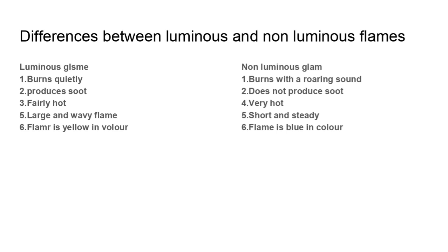Now, this soot produced in the luminous flame is a result of the unburned, glowing, solid carbon particles. Because they do not undergo complete combustion, they produce smoke, and the smoke is what constitutes the soot, while the non-luminous flame doesn't have such.